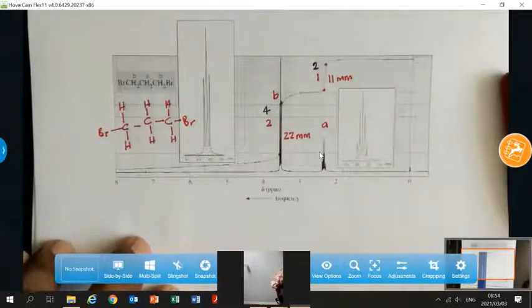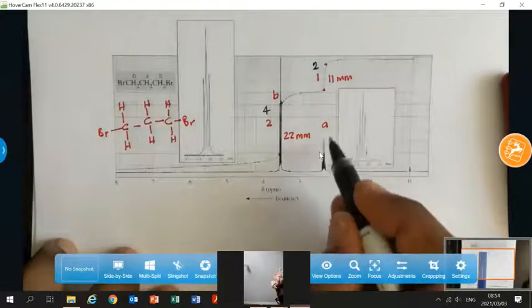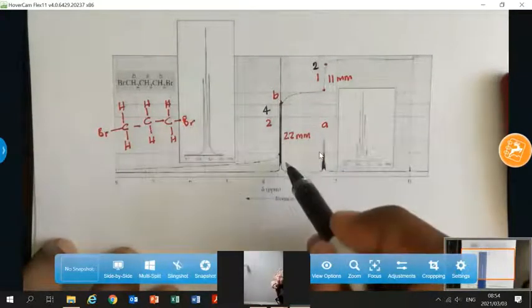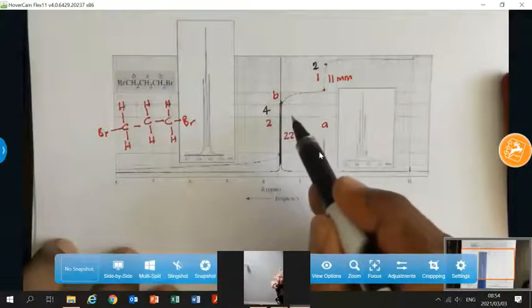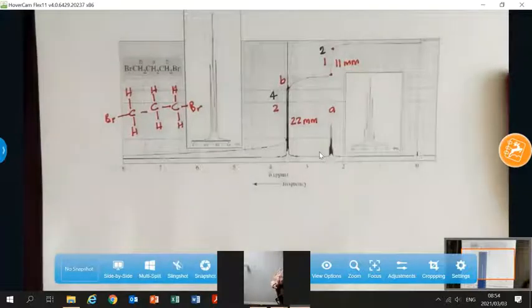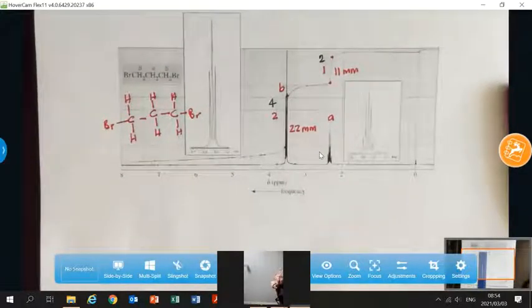So just by using integration, you are able to see where in the spectrum the resonances are. And I can now go and say that this is due to A, my CH2 group, which is central, and this is due to B, the CH2 groups, which are terminal. All right, so that captures what integration is. And probably read up about that. It's not a very hard concept. It's an easy concept that you can actually get to grips with.